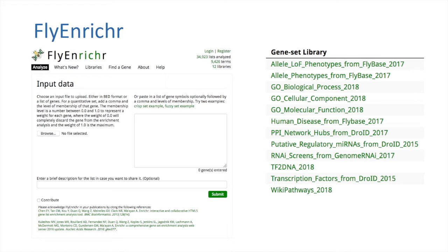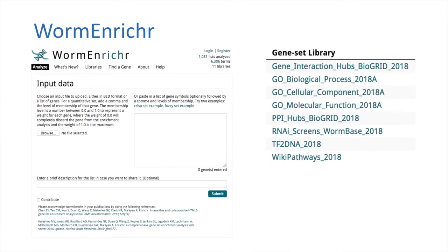FlyEnricher is an expansion of the Enricher platform for Drosophila melanogaster. Among databases that store species data for a variety of organisms, we made use of curated fly data sets from Drosophila-specific databases, FlyBase and DrowID. Worm Enricher is an expansion of the Enricher platform for C. elegans. Again, we made use of curated worm data sets from WormBase.